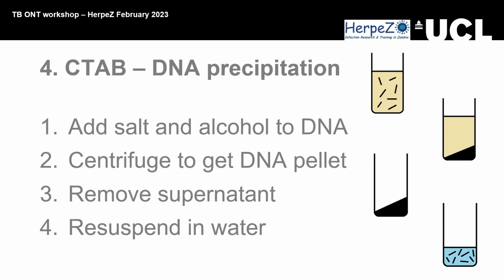It's really important as well to allow it to completely dry out, so you don't have any salt or alcohol there. I've been speaking to a team at Nanopore who we work with, and they were saying that with the CTAB extraction method, what we're finding, and we found this as well, is that when you sequence TB and compare it to, say, Klebsiella, it doesn't sequence anywhere near as well, and that's why traditionally we put a lot fewer TB samples on per run.